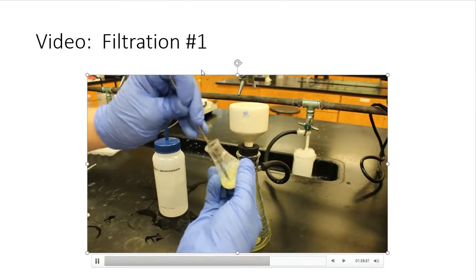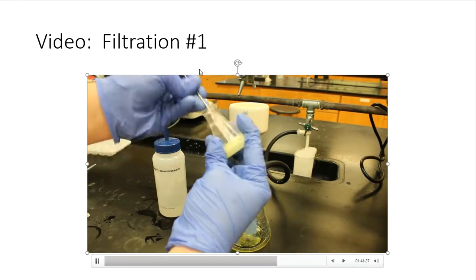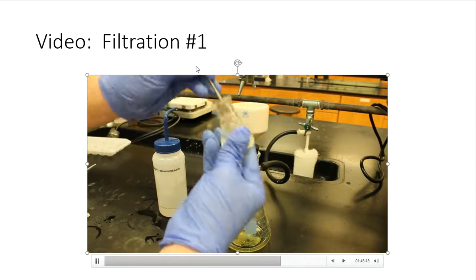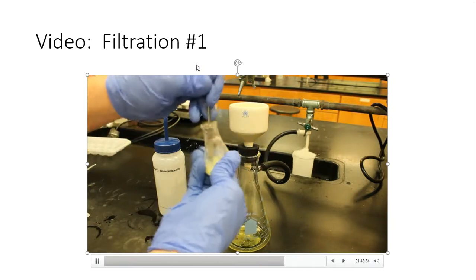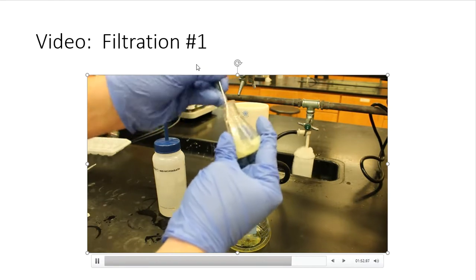The data sheet is probably going to ask you for observations on the crystal as well as the liquid that's below in the filter flask. So just try to make an observation of this as you begin to watch these videos for the filtration of each one.